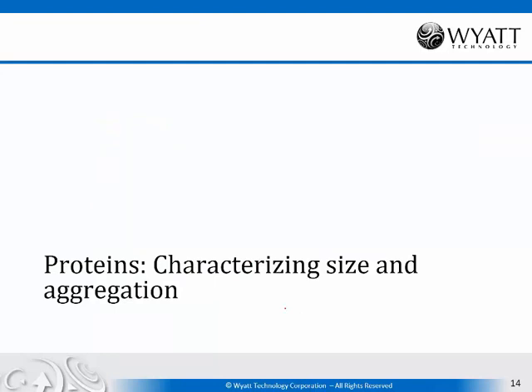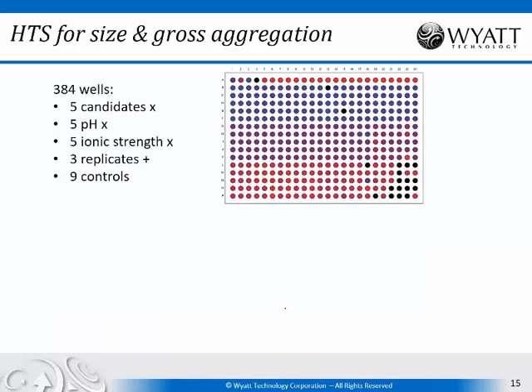Okay, so the first set of applications I'd like to explore are those related to proteins. Just the first thing that you do with a protein: what's the quality of the solution? Measure the size and the aggregate content.